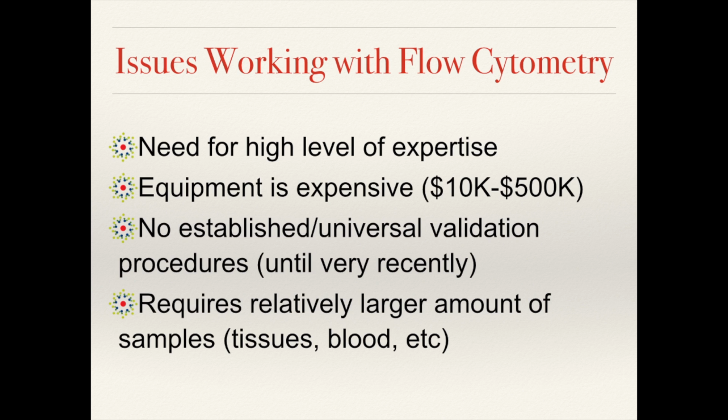So there are several issues that you will encounter when working with flow cytometry. The first is that you will need a higher level of expertise. A lot of training is required when learning and understanding flow cytometry.